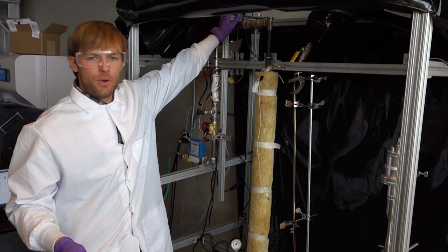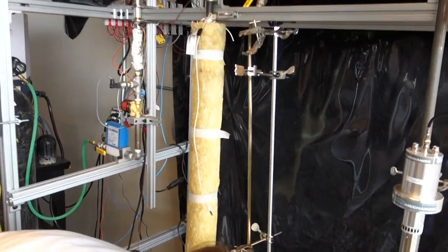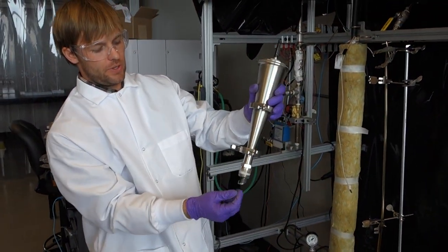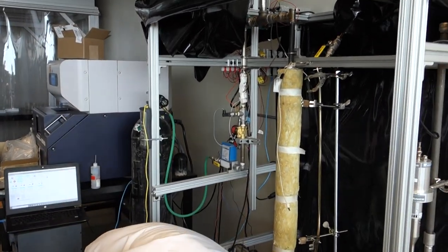Our biomass is fed into our reactor right here using an Auger system. This spins and we can control the heat rate of our biomass in the reactor.